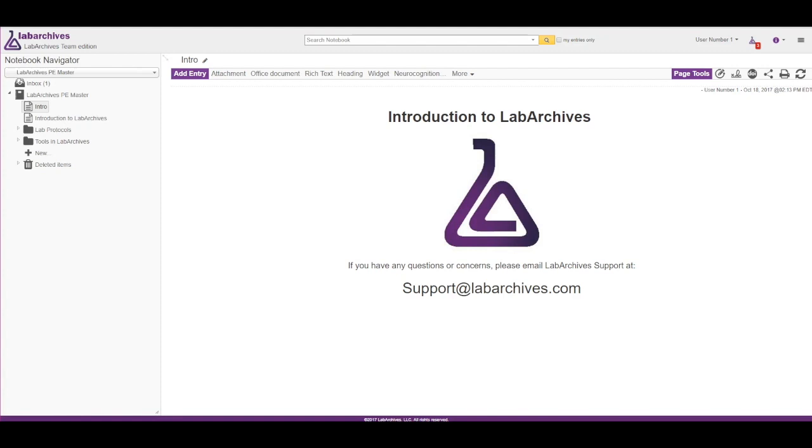This video will be a brief introduction to LabArchives. LabArchives is an electronic lab notebook. That means you can securely store, search, and share your laboratory data. LabArchives is cloud-based, and you can access your lab notebook anywhere using an internet connection.